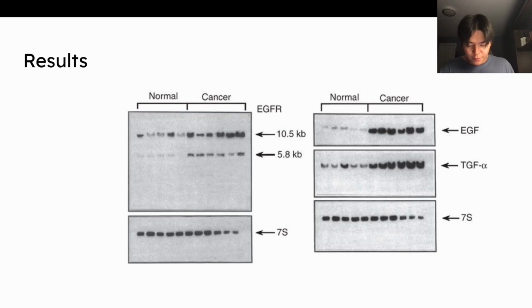And so if you look at some results, these are also inverted in color. But we can see for this, EGF is epidermal growth factor, right? We can see that cancer has a lot higher expression than normal cells, right? And imagine we did this with the Southern blot instead. We would get positive across the whole thing, right? We wouldn't be able to see a difference. But in gene expression, we can see that cancer cells express this gene a lot more.